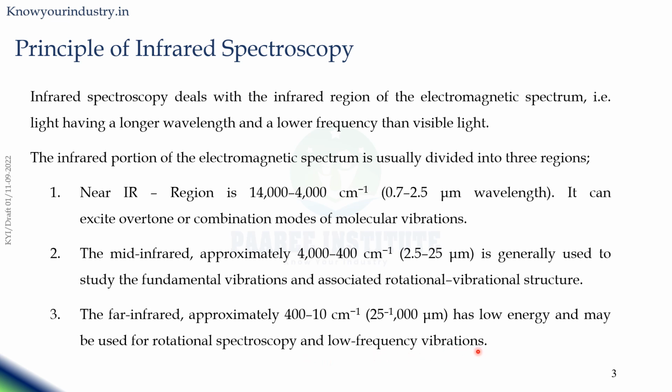So for near IR, the range will be from 14,000 to 4,000 cm⁻¹, mid is 4,000 to 400, and far is less than 400 up to 10 cm⁻¹. And each region adopts different kinds of molecular excitations, including molecular vibrations and the low frequency vibrations.